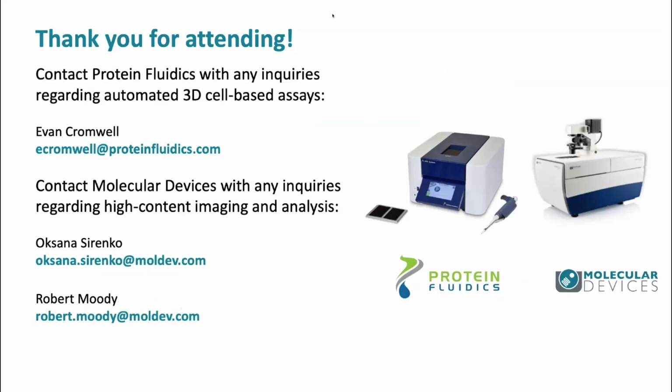The most interesting example is 3D analysis, where you can not only count cells but also define distances between cells, as well as volumes and intensity, and you can define an object within a larger object.